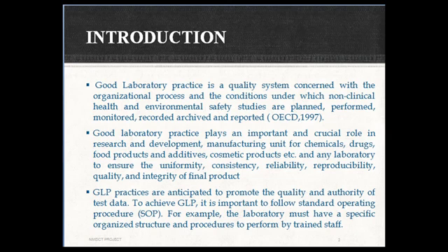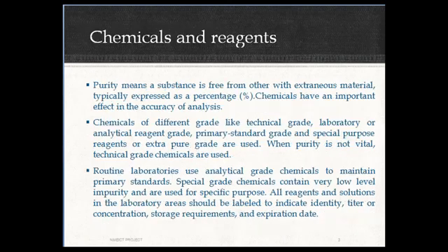Good laboratory practices are anticipated to promote the quality and authority of test data. To achieve good laboratory practice, it is important to follow standard operating procedures. Now let's try to understand how chemicals and reagents are maintained for good laboratory practices.